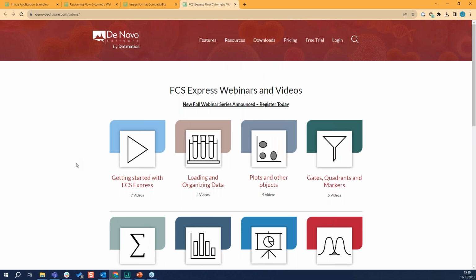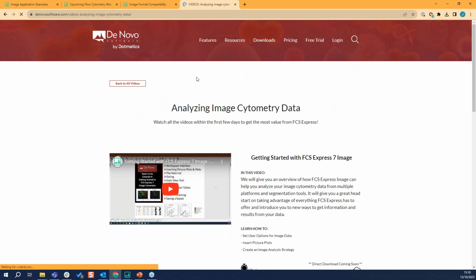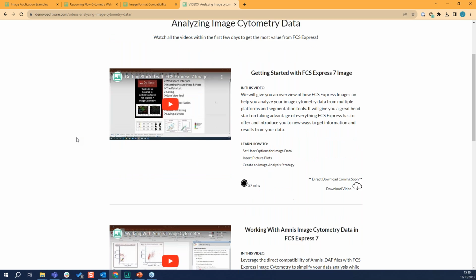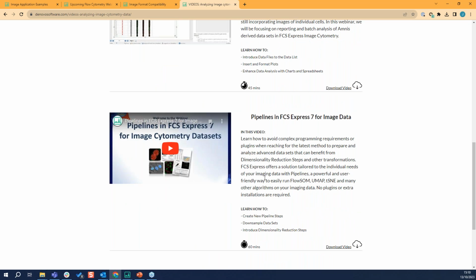So if there's a particular thing you want to learn and you want to see if we have a video for that, you can come in here. For example, we can come to Image and find all the videos that we have on imaging, such as this webinar. Also, we have a few different videos about Amnis or about pipelines in FCS Express.